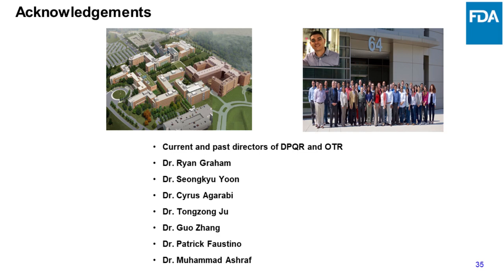Okay, and what is the lowest dilution factor you could use and still have no matrix effect? Yeah, I think it is tied to the first question. The lowest one I have used is only 2x dilution for some of my media samples. Again, I have internal standards, so I can track what's going on, but that is the lowest I have used, and I have seen no matrix effect even at that low dilution factor.